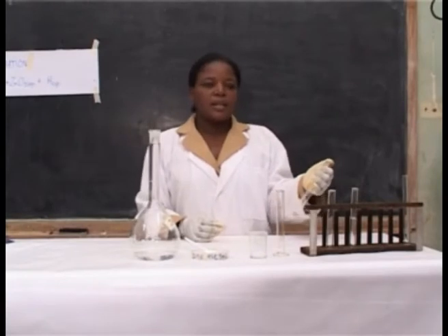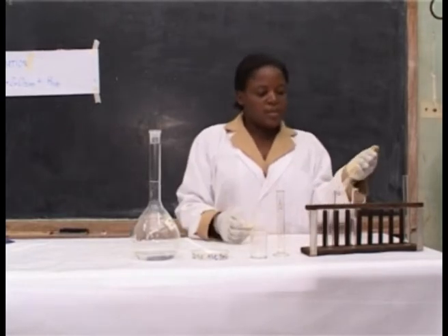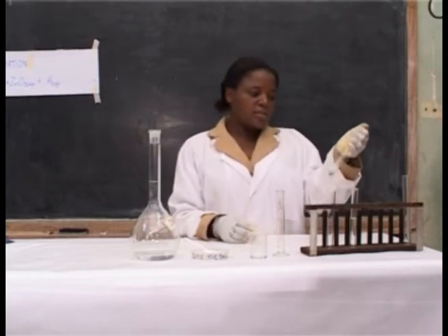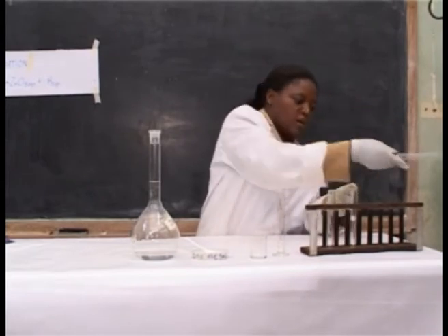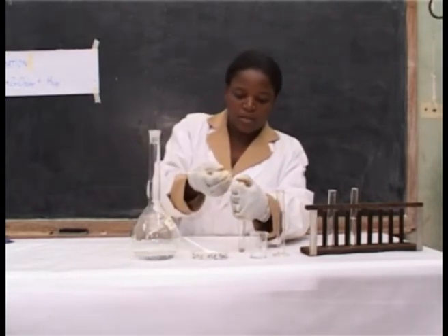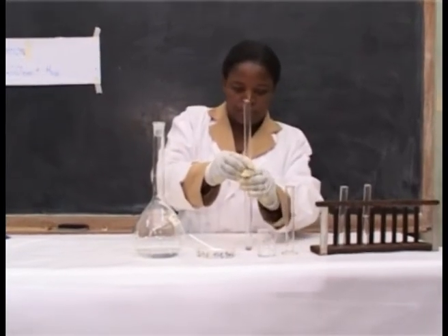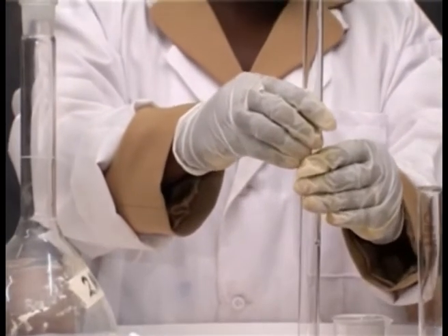Take another test tube and invert it over this tube which contains hydrochloric acid and zinc granules so that you collect the gas which is being evolved. Make sure you don't allow any gas to get out of the tube. Press it well and wait for some time.